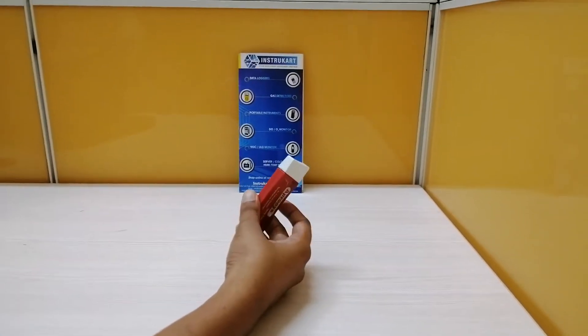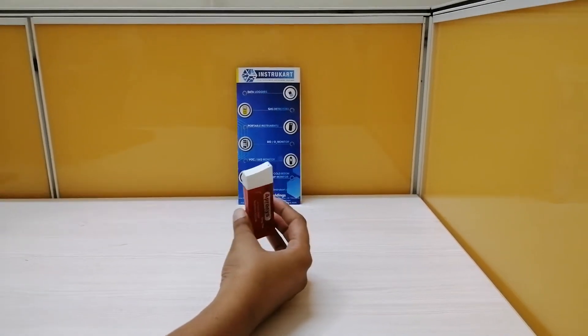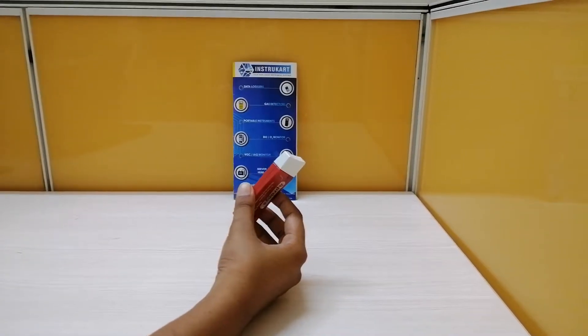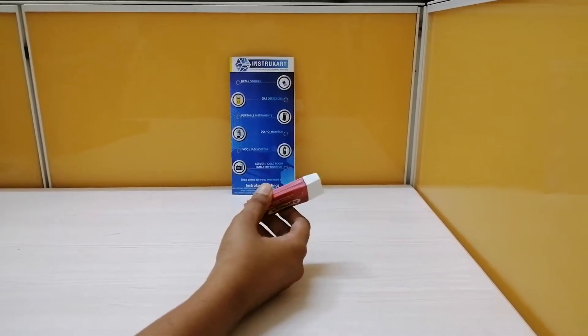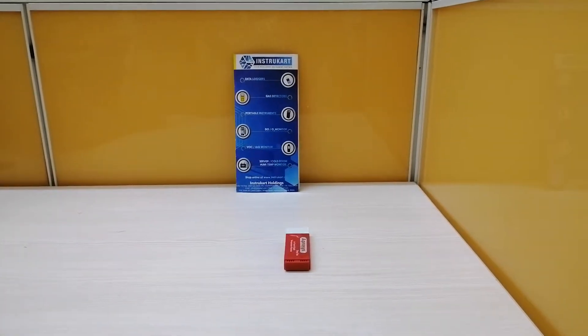This is a durable and portable data logger which is dustproof, shockproof, and fog-proof. It has high accuracy of plus or minus 0.5 degrees Celsius. You can download the software from the Apresys website, and I will show you that software.